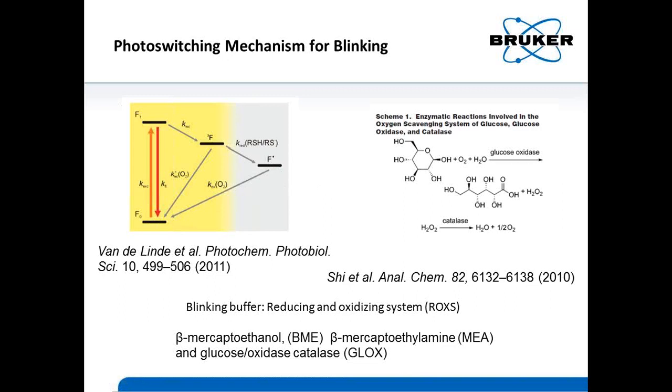I've given you 3 or 4 publications here. There are a lot of publications talking about the photo-switching mechanism and how molecules blink. But I would suggest that you look at the references I've given here, because they gave me a really good idea of what kind of dyes to use, how to control the blinking characteristics, and especially, if I have multiple dyes, how to make sure that all of them work optimally in the same buffer. Things have definitely gotten a lot simpler than they were 3 or 4 years ago. I think a lot of advances are definitely being made in the field.